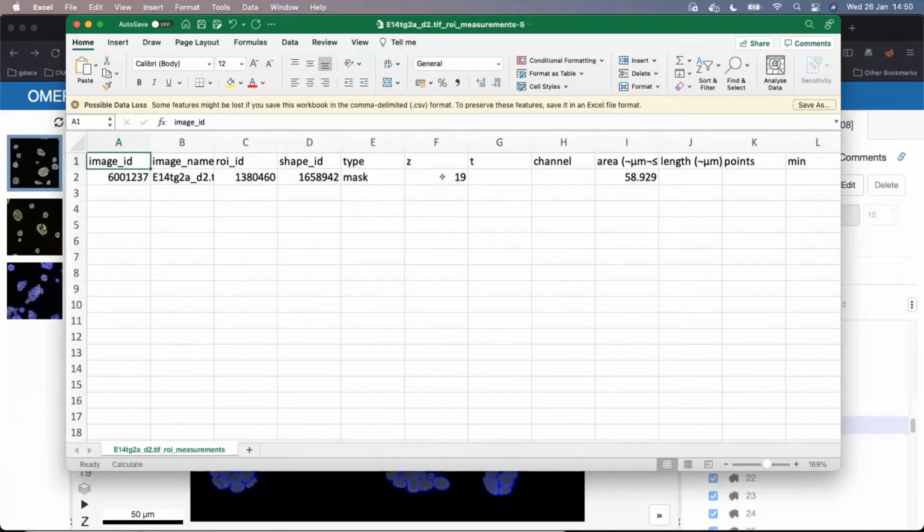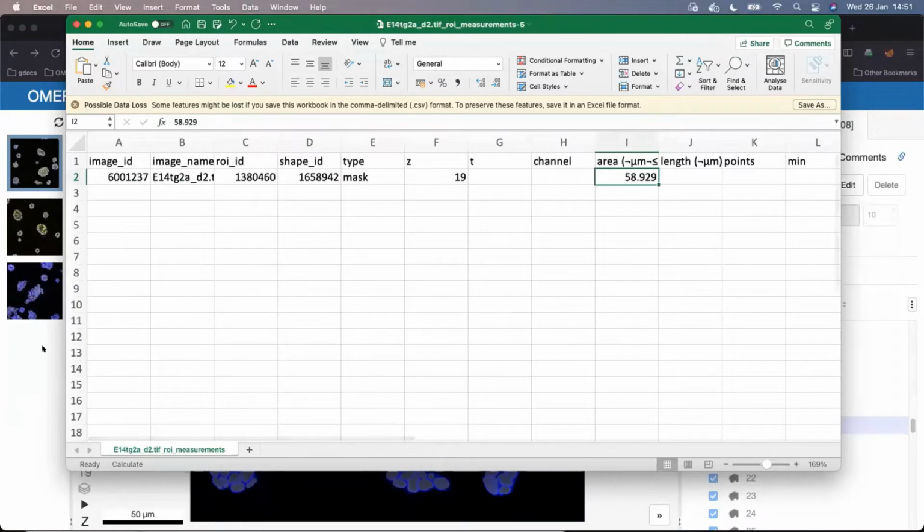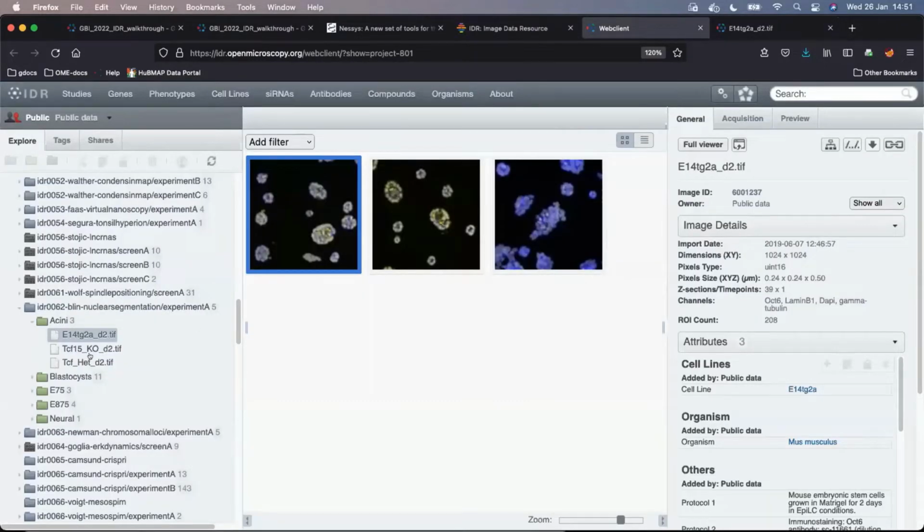And if I wish so, I can now, let's say, compare the analysis with what the authors claim in the paper in the PLOS Biology, which we just studied a second ago. That's their submitted regions of interest. So this is again an important quality assurance step which the scientific community can do inside the IDR. Speaking of which, we can now come back to the study.